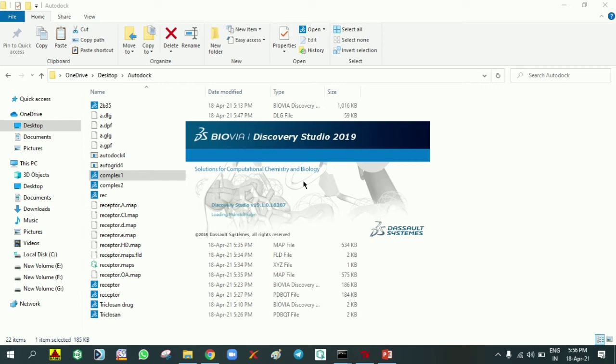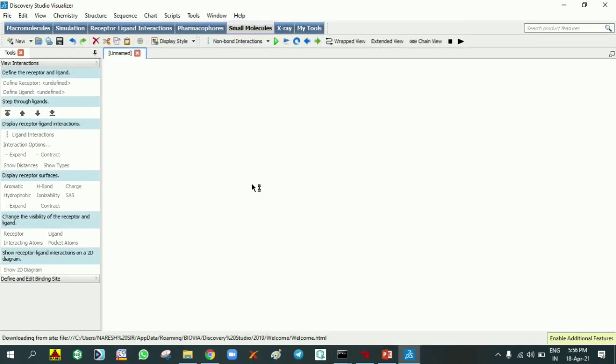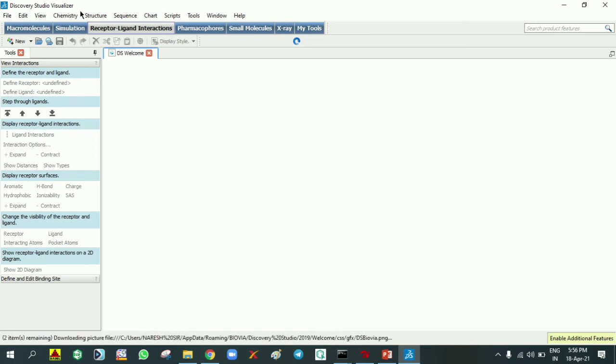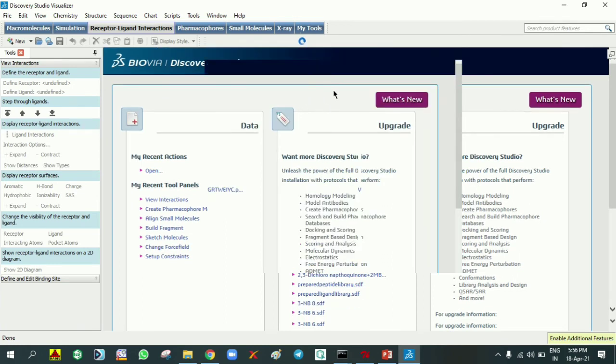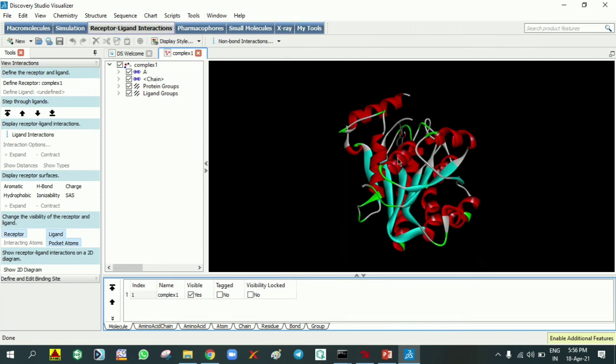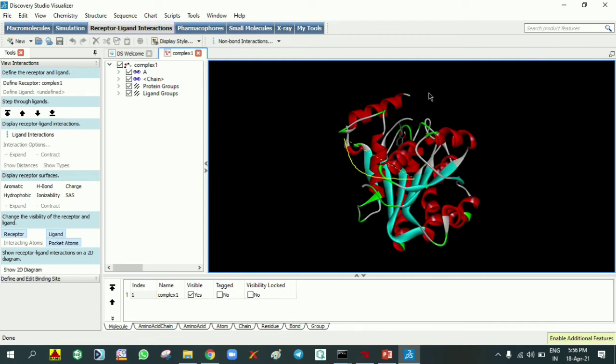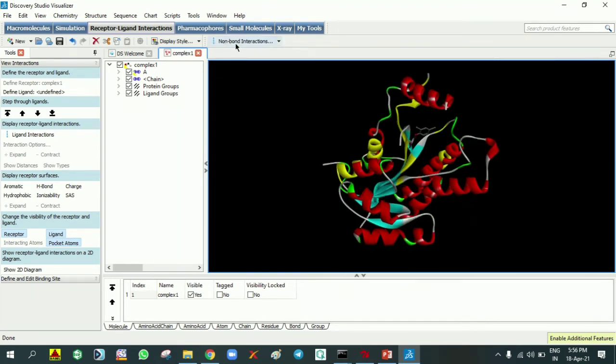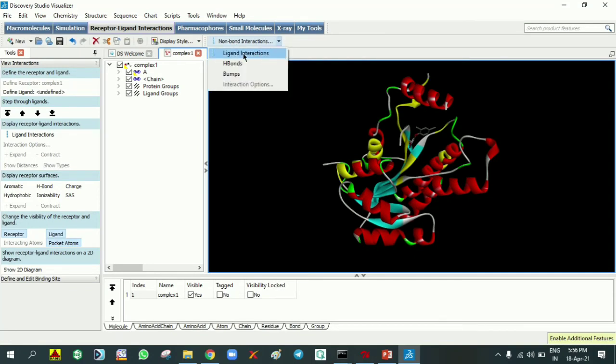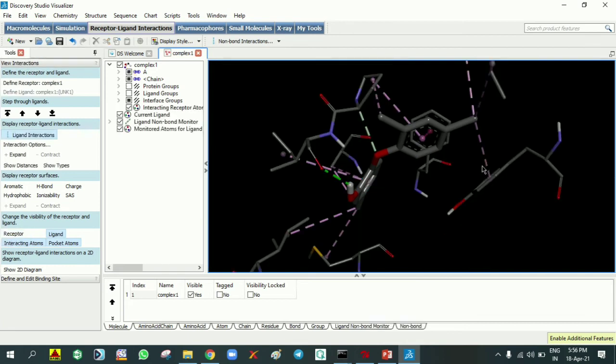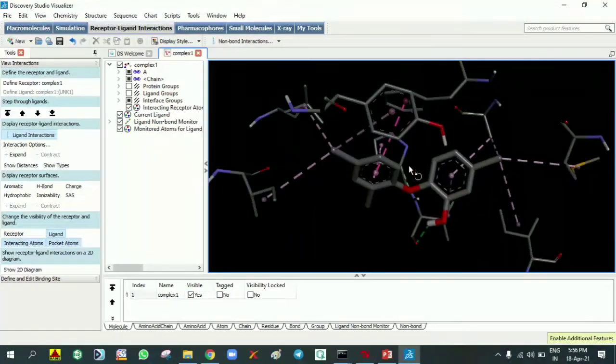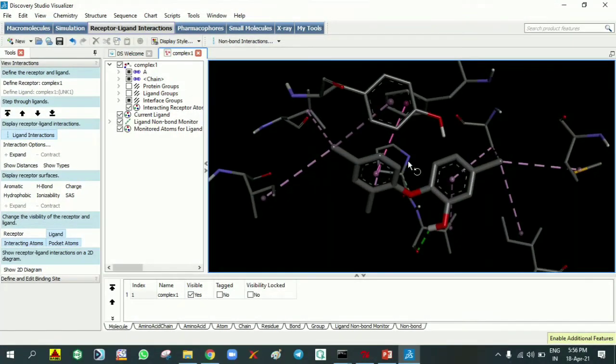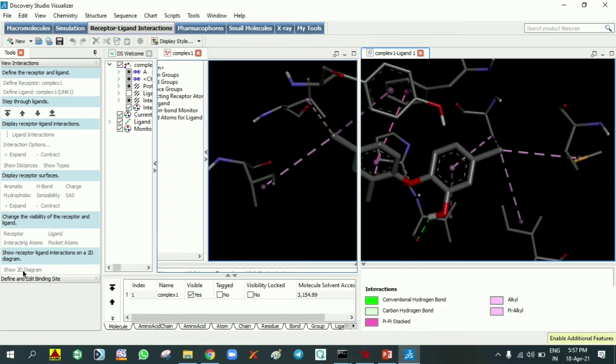All the plugins are checking and it is opening. This window we can see is Discovery Studio Visualizer. We already clicked complex 1, so it is loading. You can see here the protein along with the ligand. Go to non-bond interactions and click ligand interactions. You can see the different interactions between the protein and ligand. We can easily see the 2D picture clearly, what interactions are there, by clicking show 2D diagram.